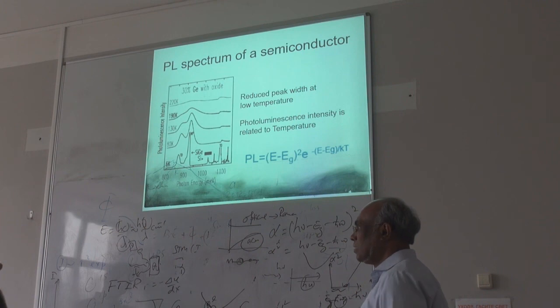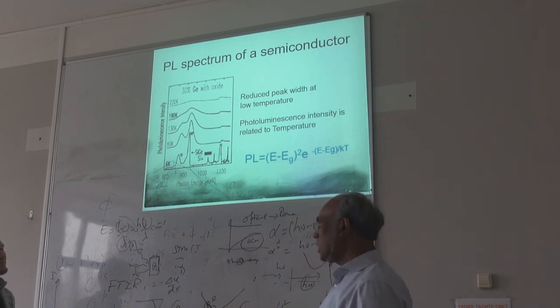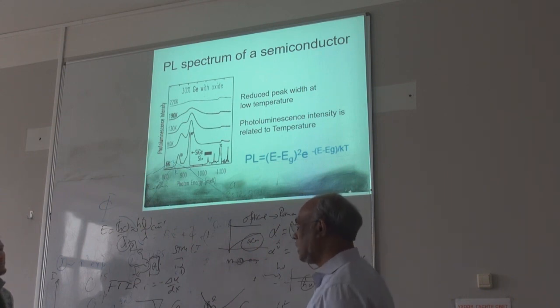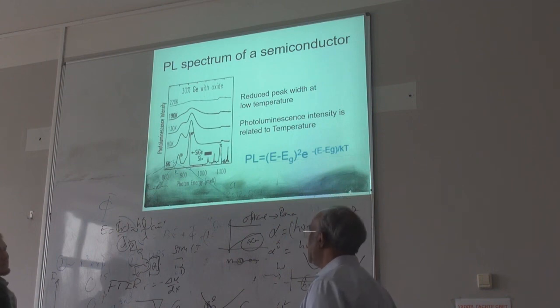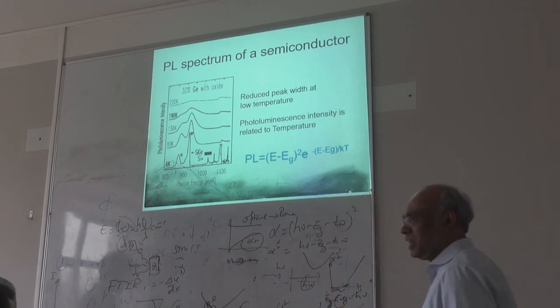Like in our lab we have something called the Linkam stage. You can cool it down. Right now we don't have helium temperature, we do only 77 Kelvin with liquid nitrogen. Okay, I'll stop here, that's too much. Thank you.